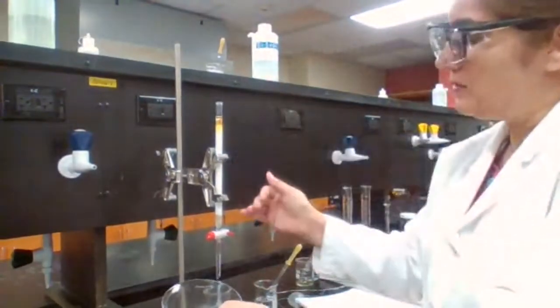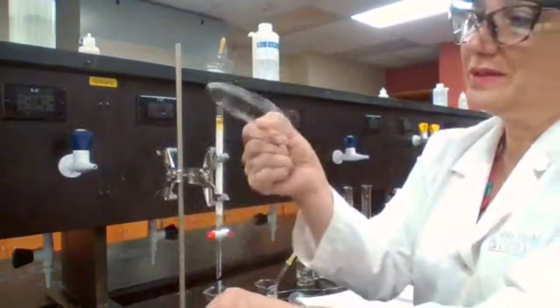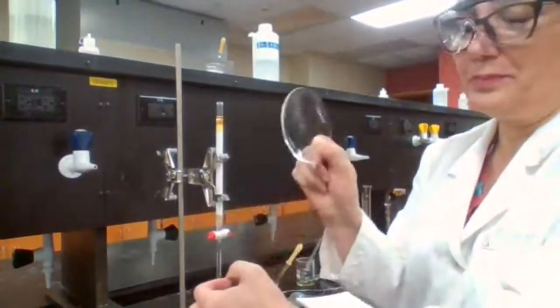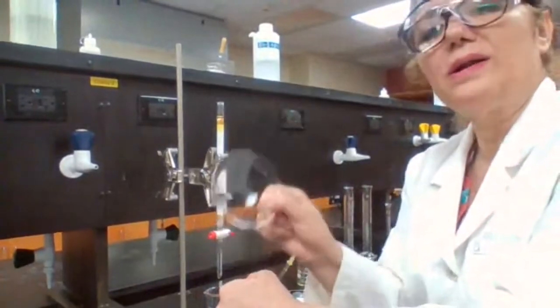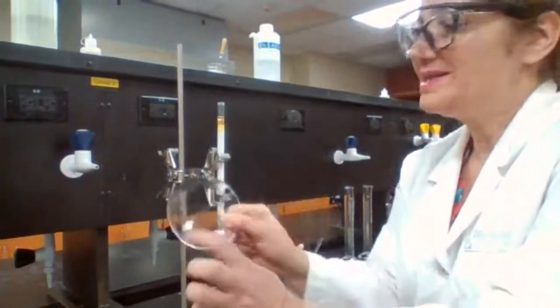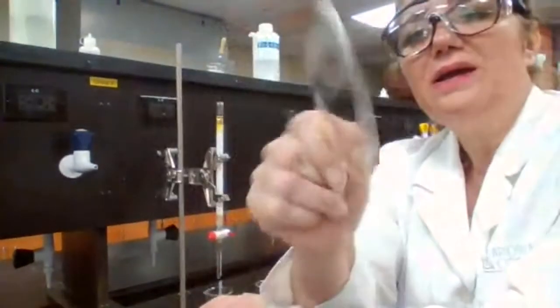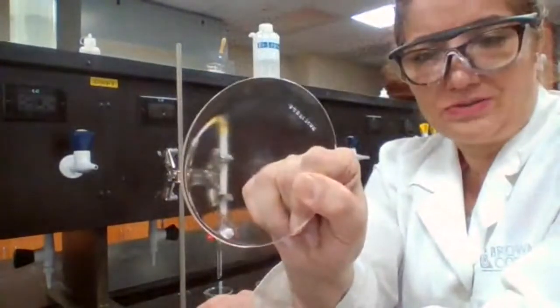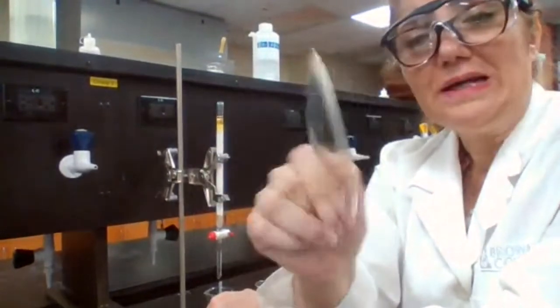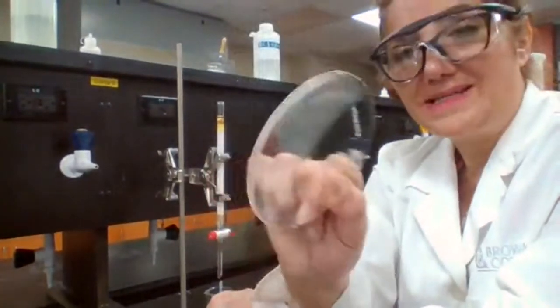I have to test it with the watch glass to see if I'm getting pure hexane or hexane plus the fluorene. When it's just the hexane, after it's dry, it doesn't leave any white residue. When it's the hexane plus fluorene, you will see the residue.